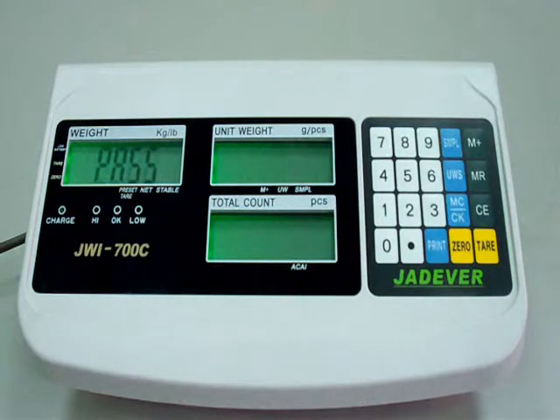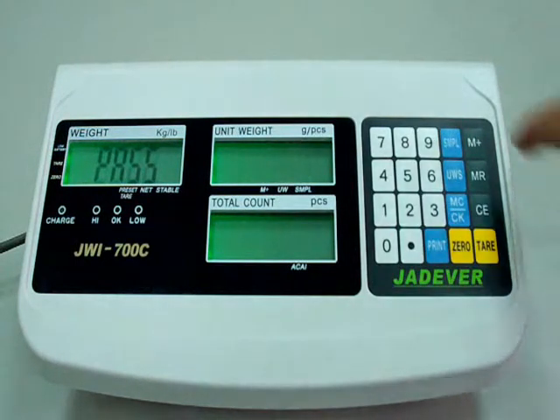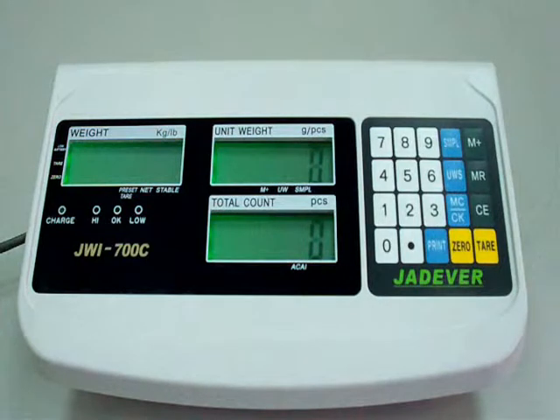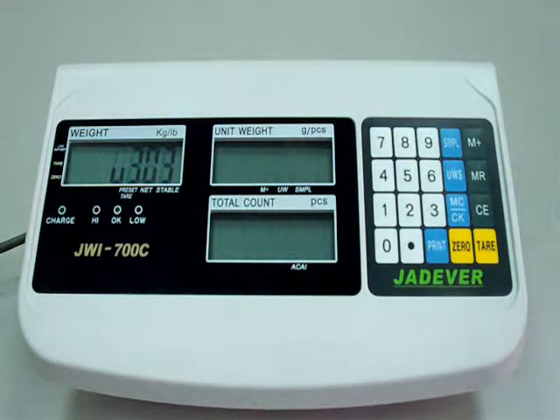Press key sample to save, then press key zero to return to normal weighing mode. The single point calibration procedure is now finished.